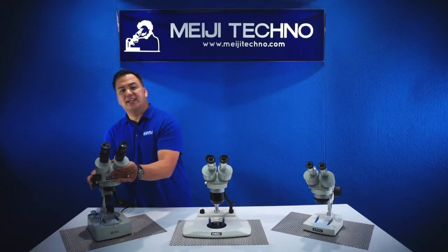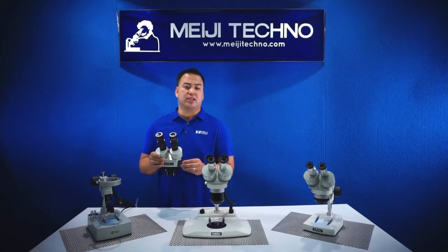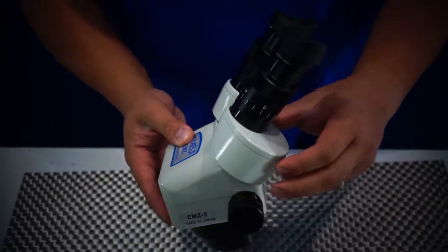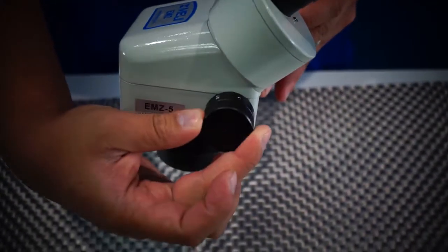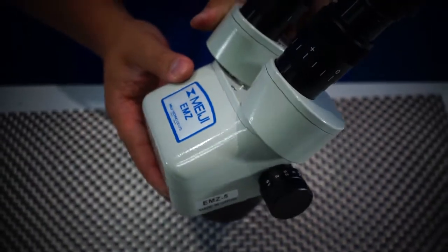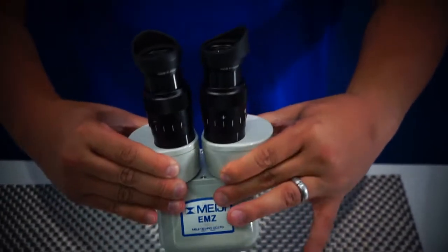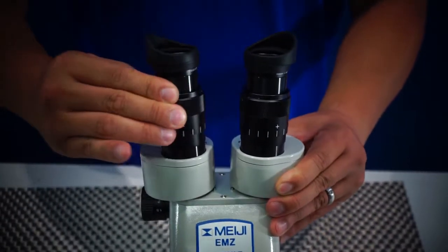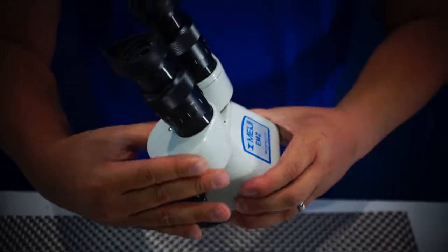Our last and most popular and most versatile model in our line is our EMZ Zoom series. The EMZ series gives users multiple magnification options from 0.7x to 4.5x, or 1x to 7x depending on the model. The EMZ series has more than 10 different models available and depending on the model it gives users multiple working distance options.